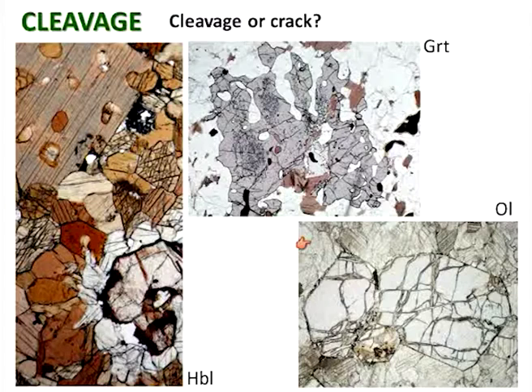So there is some suggestion of that brickwork cleavage that I think you've been shown perhaps in kyanite, which does look somewhat like that. But in this case, no, these are actually cracks, and the reason we know that is because olivine has no cleavage. So you will only ever see cracks in olivine.